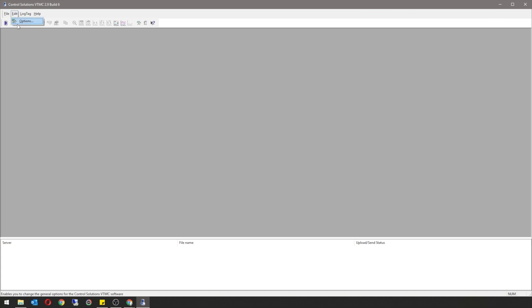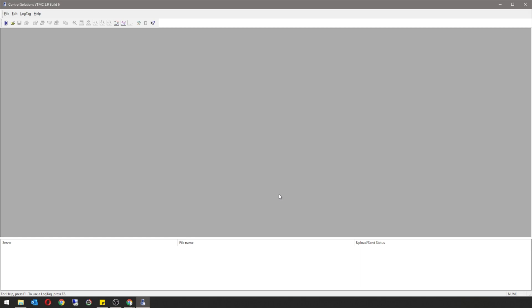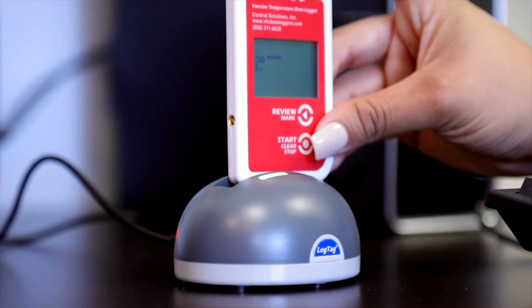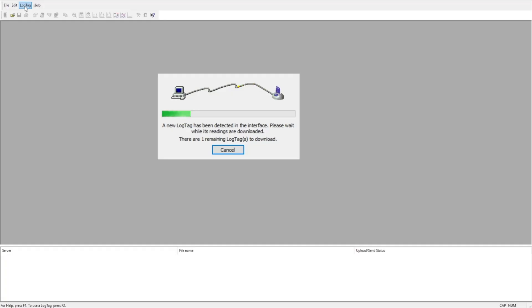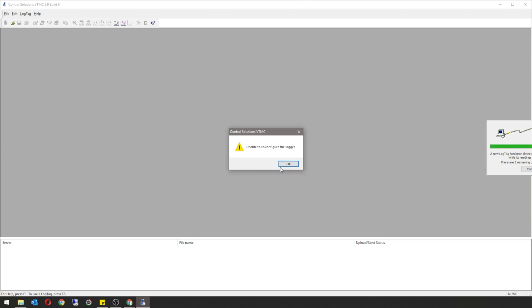Go to Edit and then Options. Select your temperature scale to be in Celsius or Fahrenheit, and then press OK. To set up the VFC 400, insert your logger into the docking station. You'll get a pop-up saying a new log tag has been detected, and another pop-up saying that it has no stored readings. Press OK.